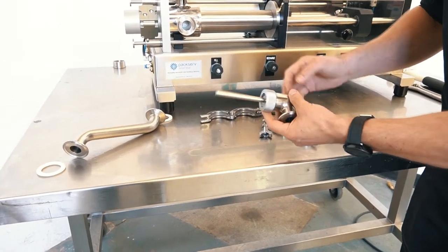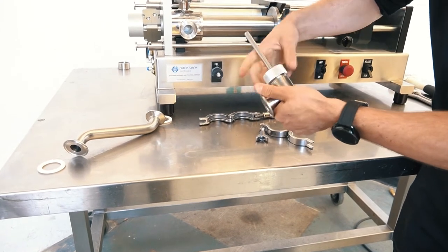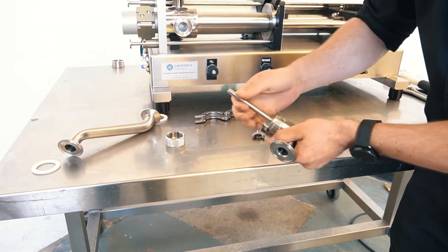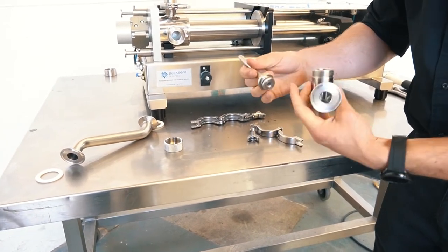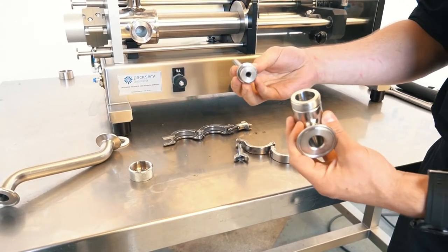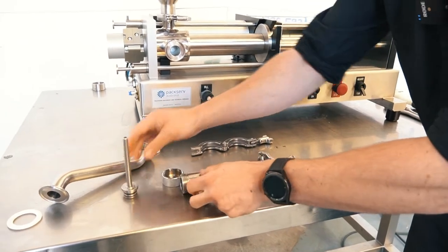For my gooseneck head and my nozzle, I've got this knurled locking ring here. That allows me to pull this apart, and then this will just gently pull out of here. I've just got an O-ring in here. If I want to do a deep clean, I'll use a blunt object like a flat head screwdriver with the edges taken off to get that out. This allows us to completely disassemble the machine and get all the remaining product out at the end of the day.